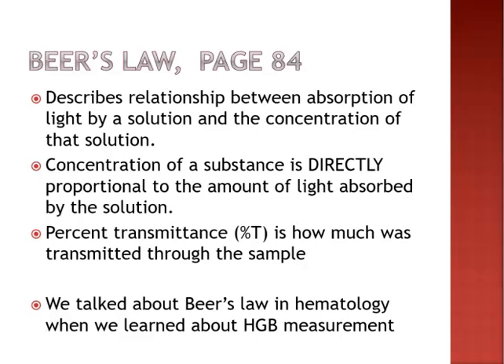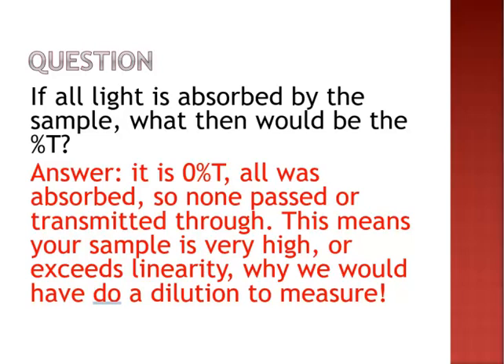And you can look on page 84 in your textbook, figure 4-3, to see an example. And of course, we talked about Beer's law in hematology when we were talking about the hemoglobin measurement. So now that we've been talking about percent transmittance, let's have a trivia question.